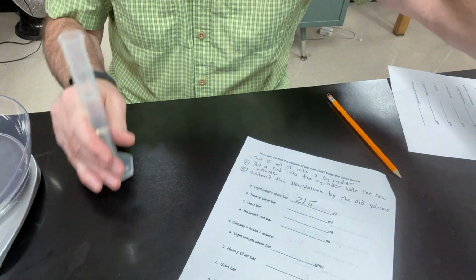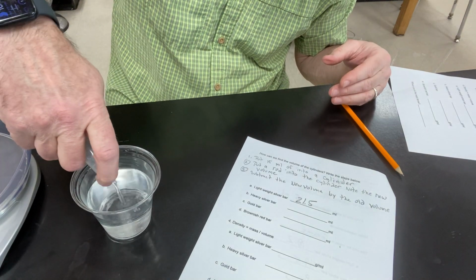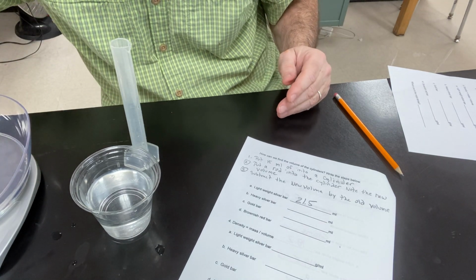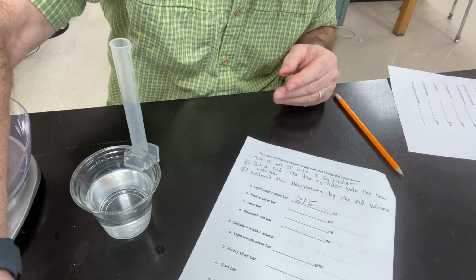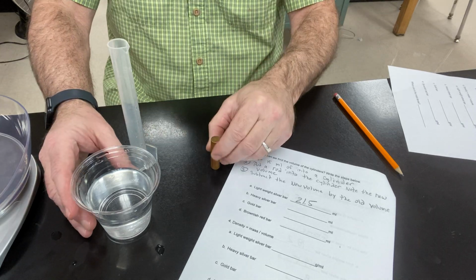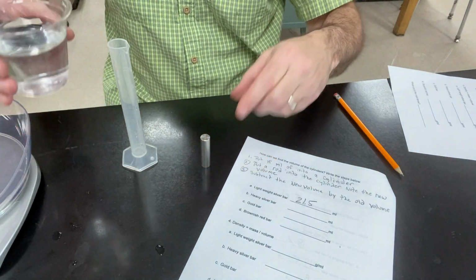Now to get it out, just put your finger over the hole and pour the water out and get the silver bar out and dry it on a paper towel. Yay, nice and dry. Okay, put it back in the slot. Second one is the heavy silver bar, so I grab that. Okay, make sure I got it. Oh, there's that. Oh, wait a minute, I'm sorry. There it is. And I put 15 milliliters in again.